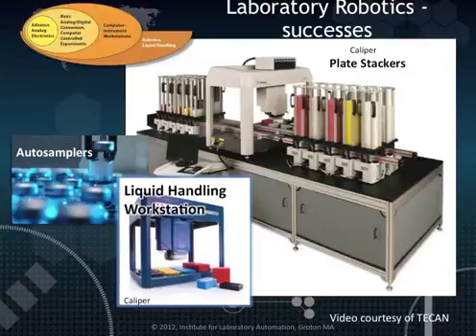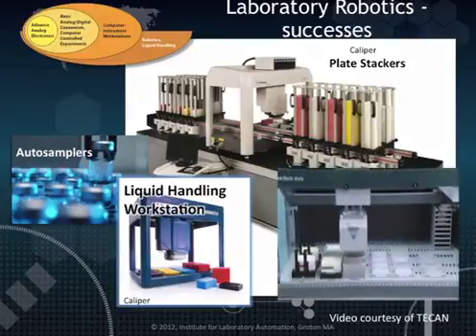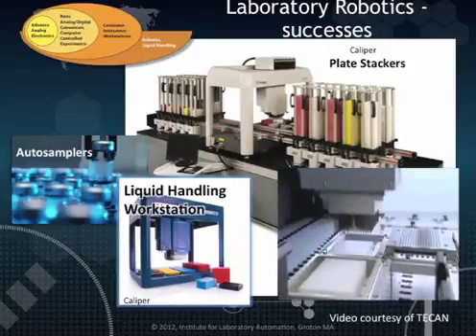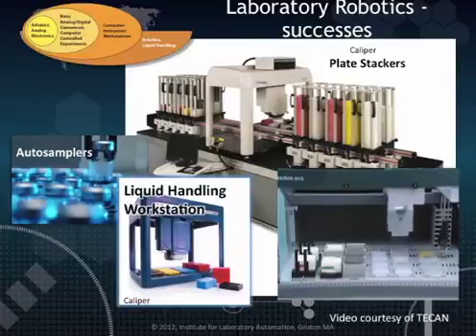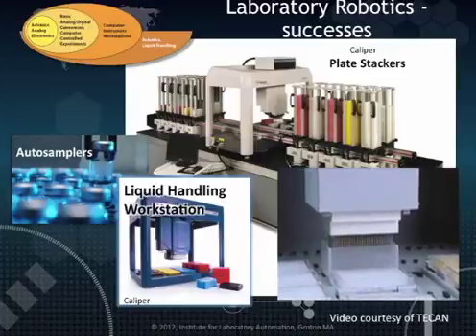Aside from being well-engineered products, the success of liquid handling systems in life sciences has depended upon a single element. The sample container consists of a standardized plate designed to hold large numbers of samples, each of which has its own sample well. Standardizing the size and shape of the plate and the arrangement of the sample wells has led to the development of compatible products from a number of vendors that can be used in automated systems. The same standardization doesn't exist in the other sciences because of the wide variety of sample types that exist.